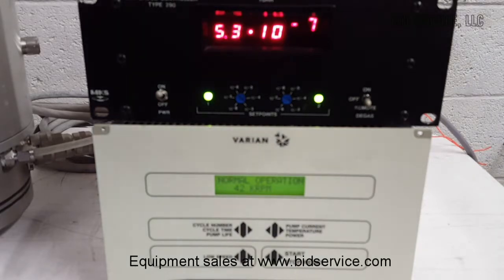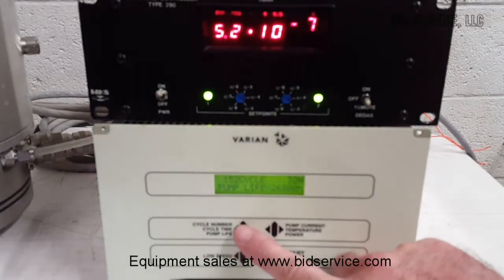Okay, the pump is up to maximum speed. I'll go through the display.